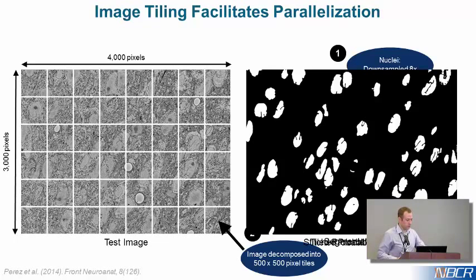And then taking it back to smaller features, of course, like I said, mitochondria, we can't downsample the image as much. So here we've only downsampled by a factor of 2, so going from 32K by 24K to 16K by 12K, just halving each dimension. Obviously, this requires a lot more tiles, as you see here, so this has a much greater computational cost. There's the example output probability map.